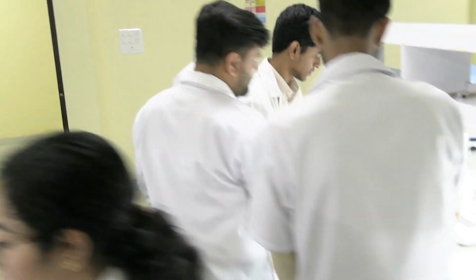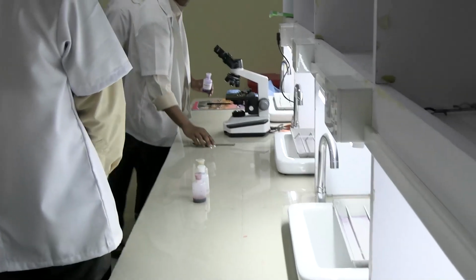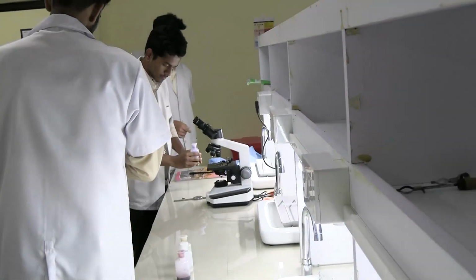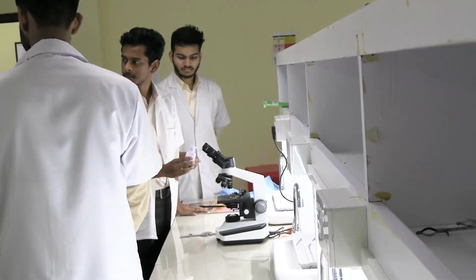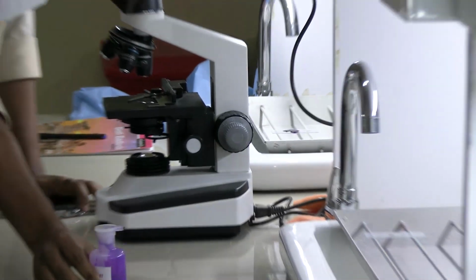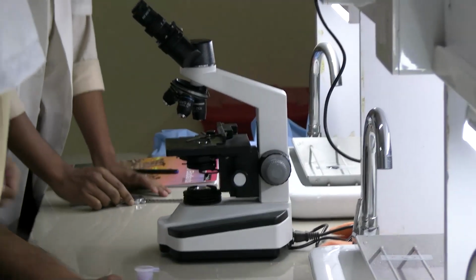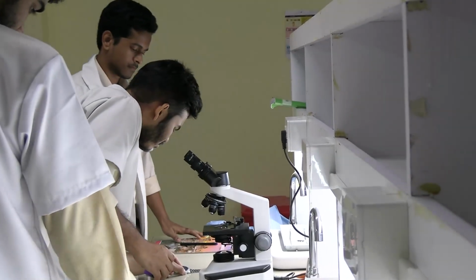So let's start the first step. First step is the primary stain. Remember, the time starts from the moment you drop the first drop. Sometimes you have to squeeze the bottle hard so that you can flood the whole circular area. So now the other one can start also, if you are keeping track of the time. Everyone has to keep track of their own time.